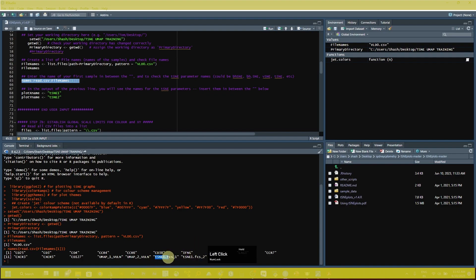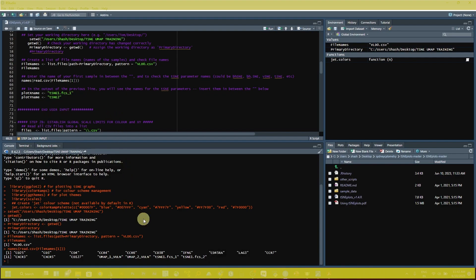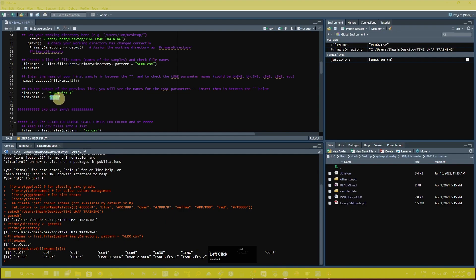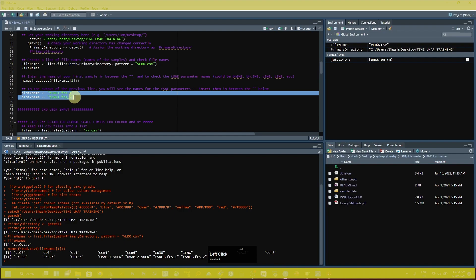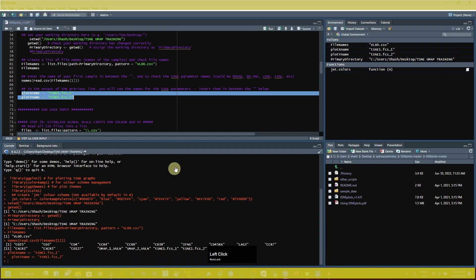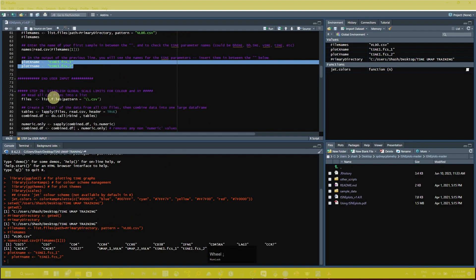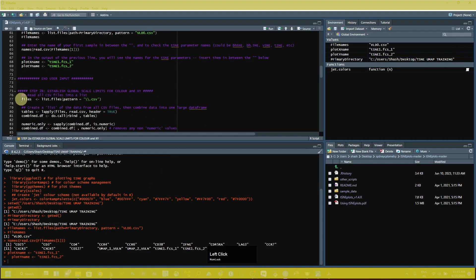Copy the x value of the t-SNE parameter and paste it into the plot_x_name field in the script. For y, copy the second t-SNE parameter and paste it into the plot_y_name field. Select both lines and click Run.